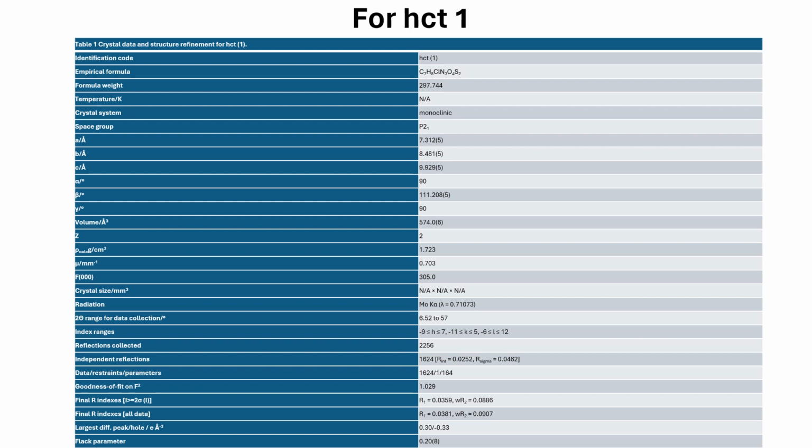So the F observed and F calculated are both in good agreement with each other. Meaning our proposed model or proposed molecule is exactly the same as the actual molecule, right? The experimental and the calculated values are almost the same. So after this assigning, we have to refine it. And we also have to check the R min and R max values.